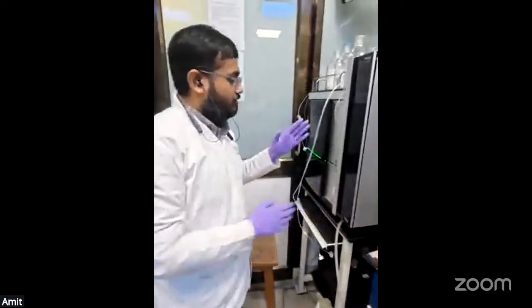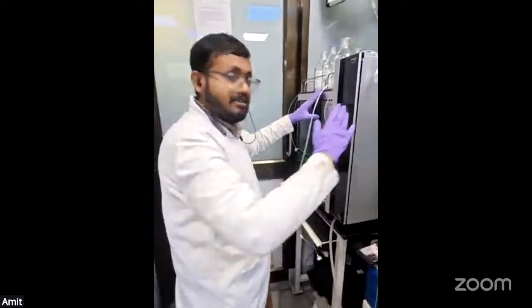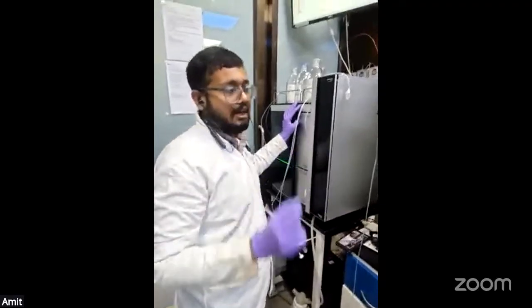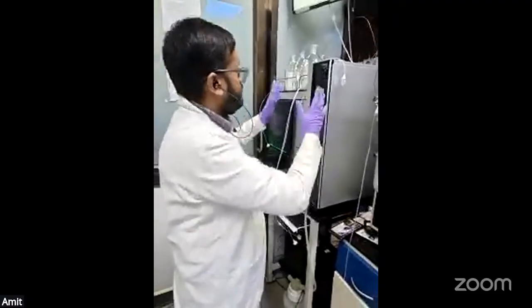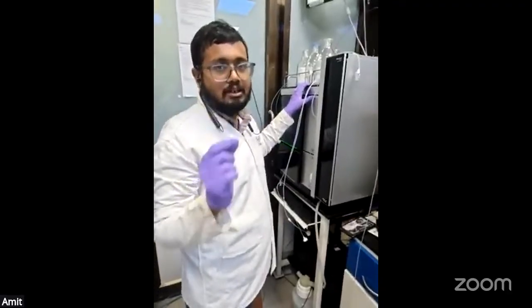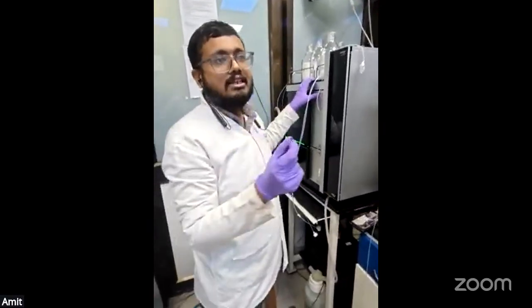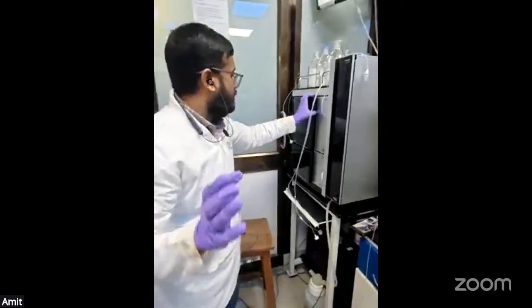What we have coupled is an HPLC. The main difference between nano LC and HPLC is the flow rate. With HPLC we get flow rates in milliliters per minute, whereas in the nano chromatography I showed, we need nanoliters per minute. Since we are here just going with a few target peptides and target metabolites or lipids, we use a high flow rate so that we have a shorter gradient, use less solvent, and can get accurate quantification of those particular peptides.